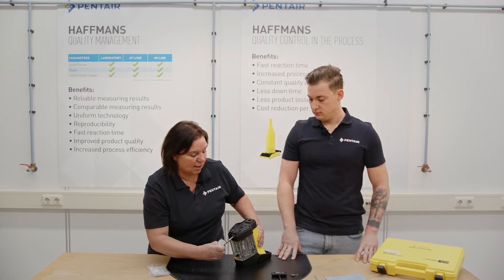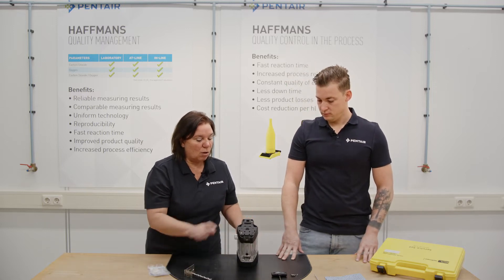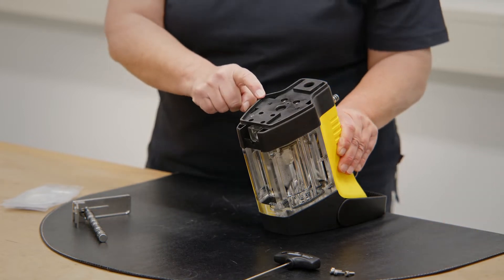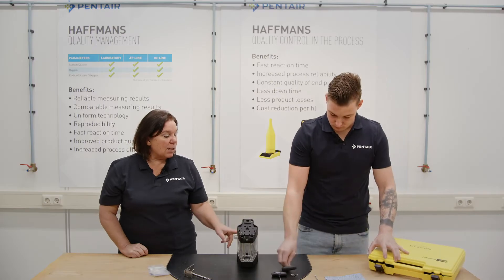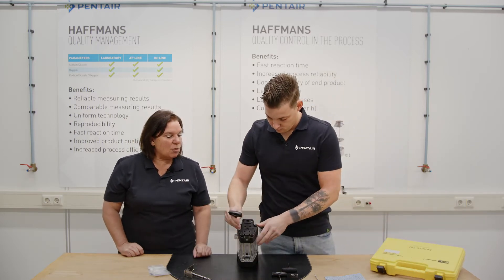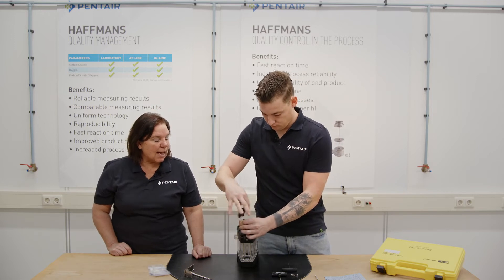For yearly maintenance, we also unscrew the six small screws of the black protection cover, and we take off the battery block so that we get access to the hose adapters at the back side.